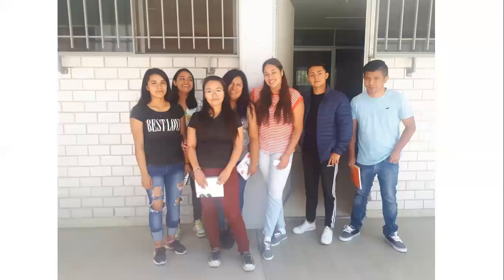And proudly, the students from the UTM visited the Instituto de Metalurgia and did practices on the XRD and SEM. If it wasn't for this COVID, I was planning for you guys to come here to the Instituto de Metalurgia, but we're trying to see if at least we can send some interesting samples to analyze. So I hope that this can be done. If not, I'm going to leave you another project, because these guys had to do some kind of report after they did this experiment.